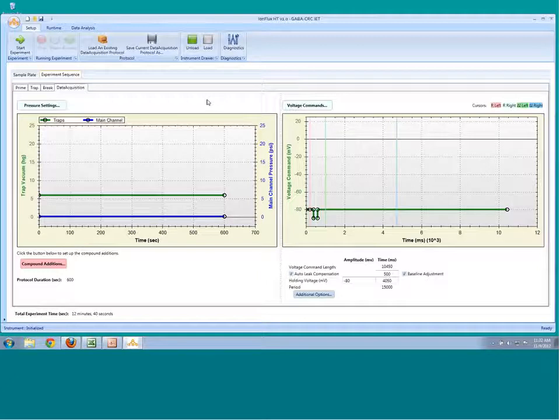So once we've defined our experimental sequence then, we would simply click on Start Experiment. So at the beginning of the day, we would define what we want to do within the software, as well as physically make up our plate. And that process might only take, on the order of half an hour to an hour, depending on the preparation steps for making solutions in the morning and isolating cells, and then loading the experimental sequence. And with that in place, then we would say Start Experiment.